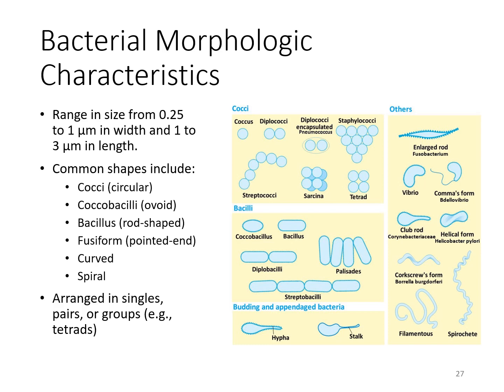Sometimes they can be encapsulated. You can have them in groups or clusters, so you can see a group with the staphylococci, tetrads in groups of 4, and then you can also have them in chains. And so here you see the streptococci that are in chains.